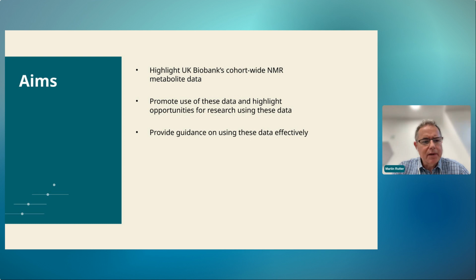As many of the people on this webinar will be aware, metabolic profiling can provide an objective biological readout of the combined effects of genetics, lifestyle, and environment, and it can be used to improve disease prediction. It can also provide mechanistic insights that will inform drug development, disease prevention and management, and also population health strategies.